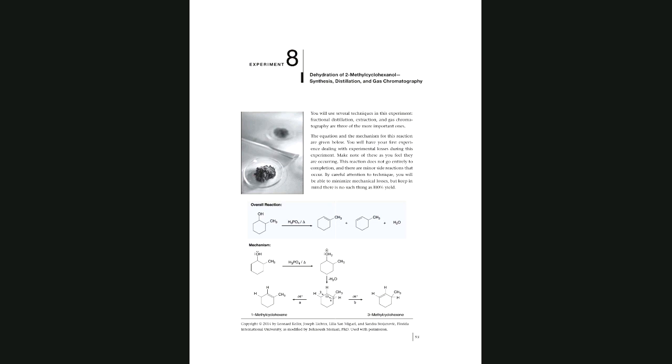No response? What else do I need? Round bottom flask for the receiving. Okay, very good.